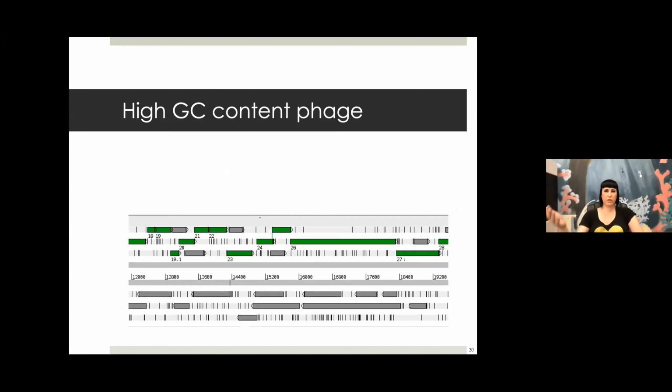Here's one such genome. I think this is mycobacteriophage L5. These obviously have significantly longer non-coding ORFs due to stop codons occurring less randomly in the DNA, which you can clearly see here. The real complication is that they favor the third position for their max GC frame in coding genes. This means that if you look at the codons of a coding gene, there are far more G's and C's in the third position than in the first or second.